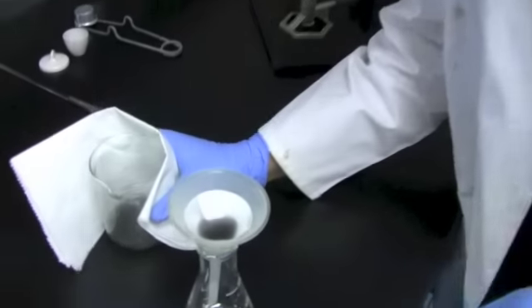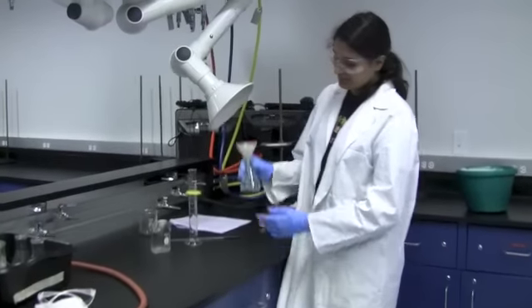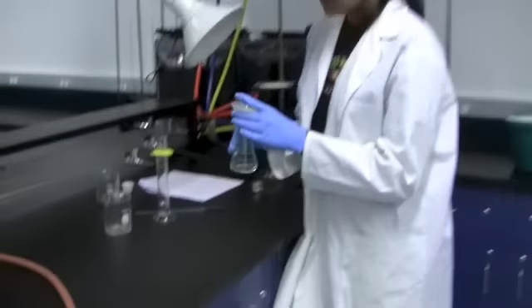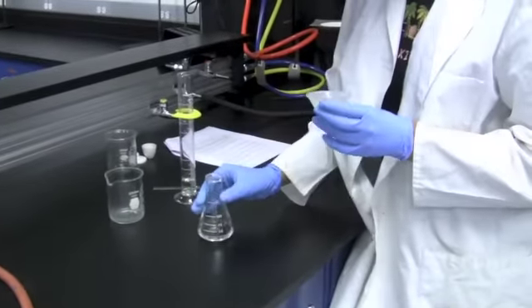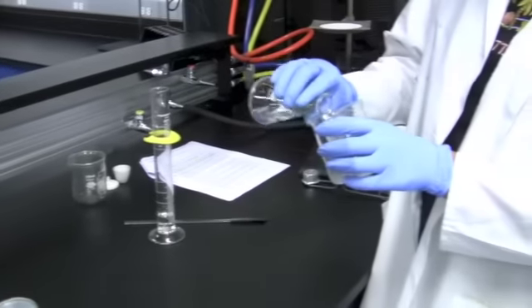And just wait while it filters out. After filtration, you're going to be left with a clear solution. Now you can throw away the filter paper into the trash can. However, you have to transfer your clear solution into a clean beaker.